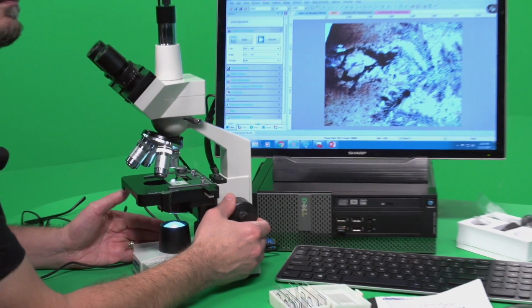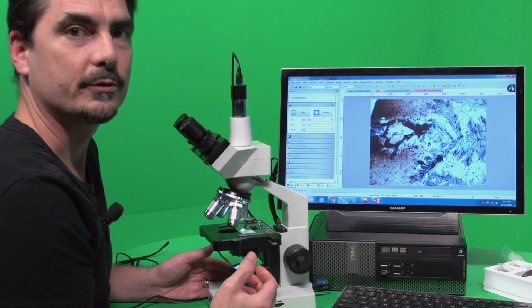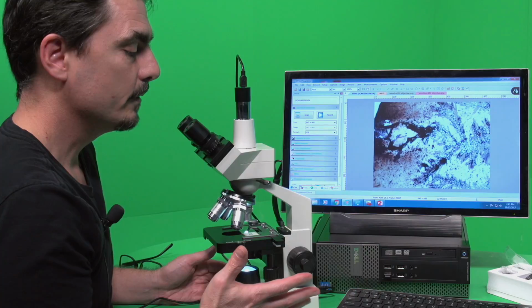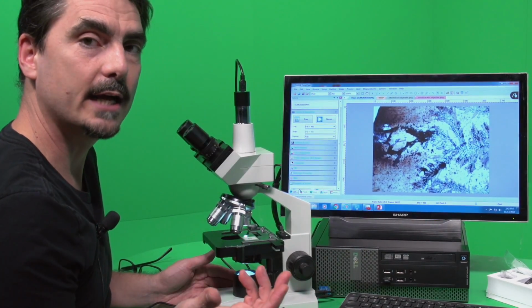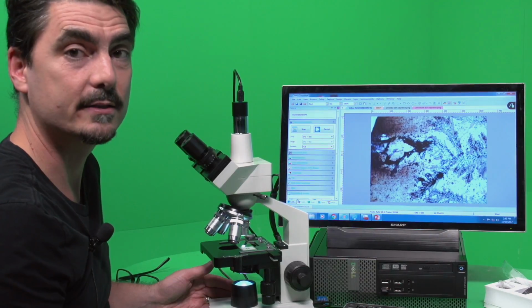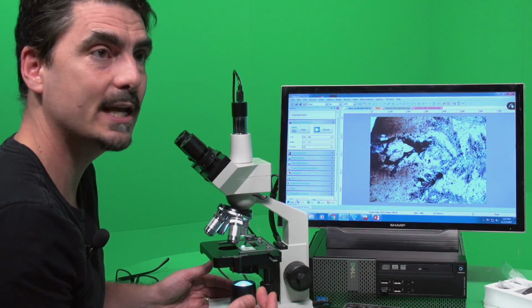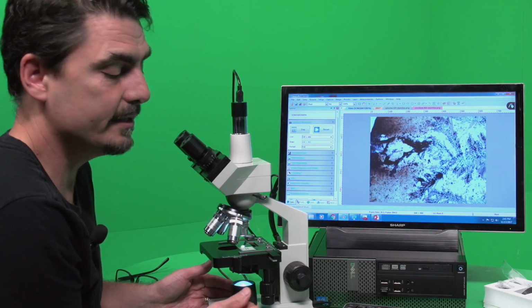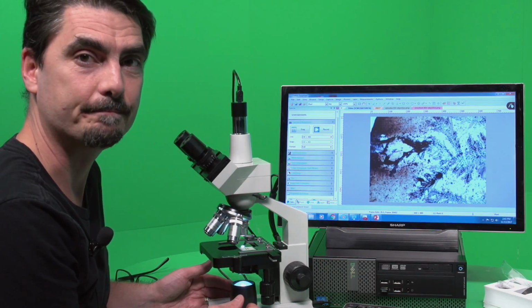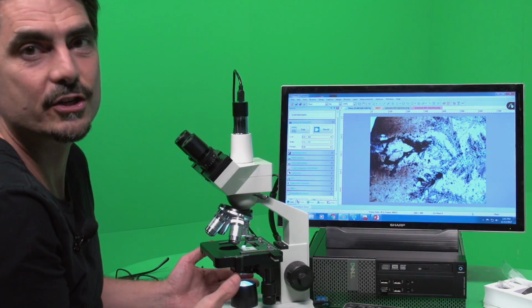What we see then is essentially, looks like magic marker, right? Well, these slides are like the slides that you're making in lab where they use, for example, crystal violet. And crystal violet is a blue to purple dye, right? And so that's why it looks like that. Some of your prepared samples may look just like that because they did the same type of staining that you did.